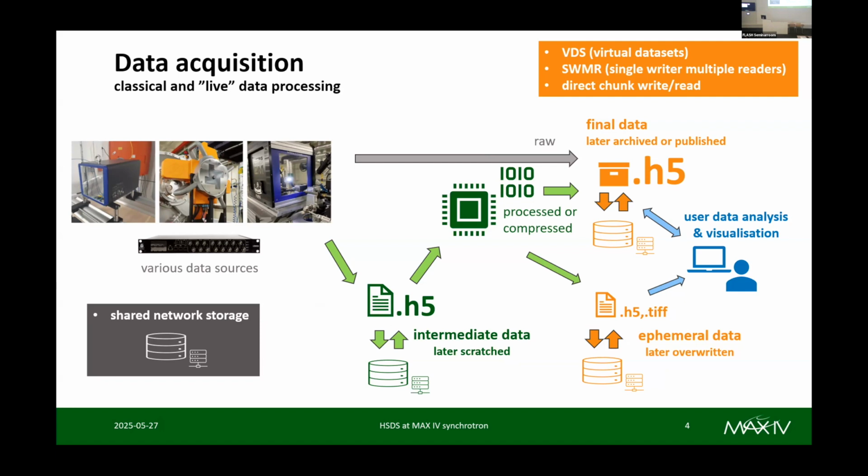There's a classical pipeline, like the creating of final data. For that, we are using virtual datasets to glue files together. We are using direct chunk write and read for getting performance, and we are using SWMR, single writer multiple readers, for example, for fast writing by the detector, and the user and other types of analysis reading.